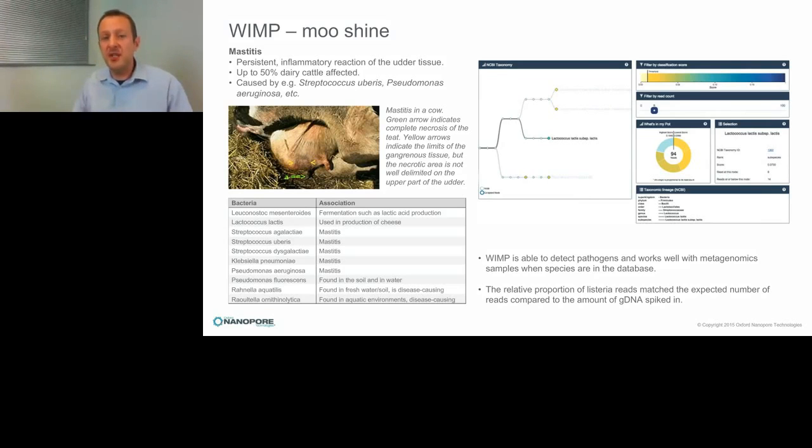Okay, so this is an illustration of the sorts of things to which a MinION and the associated workflows can be put. And it highlights the non-lab applications. I mean, you can see how useful this workflow in combination with a portable sequencer would be in monitoring the health and well-being of dairy animals, for instance. But the remaining problem is that to get the DNA extracted and prepared for sequencing on a MinION, you would still have to take various bits of lab equipment, such as a centrifuge, onto the farm or wherever you're working.